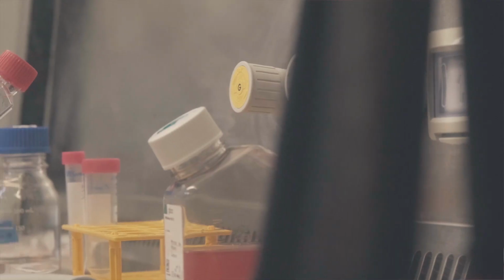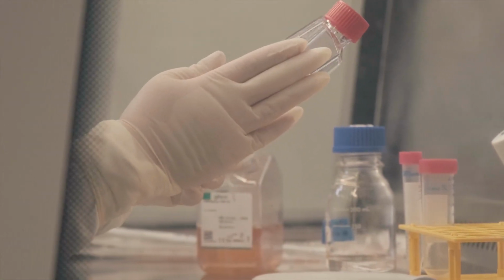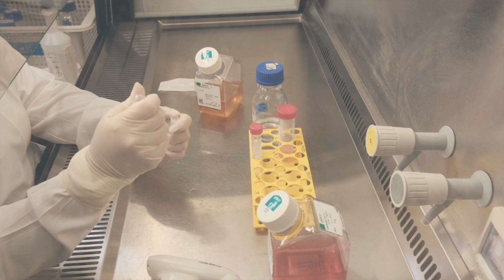We can also control airflow through the use of tissue culture cabinets. Air within these cabinets is first drawn through a filter and moves across the cabinet towards the user in a smooth laminar flow. The carefully controlled direction of this filtered airflow limits the exposure of airborne contaminants.